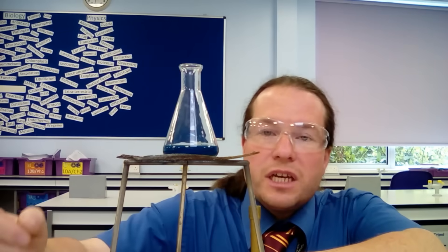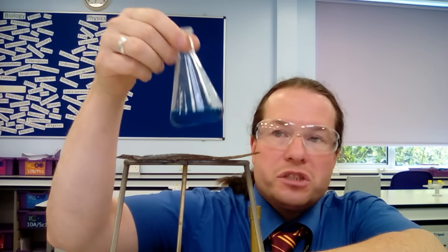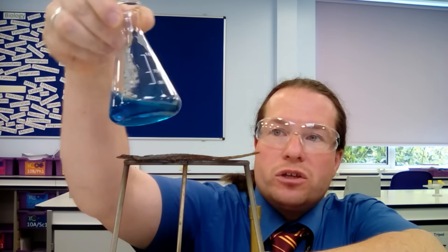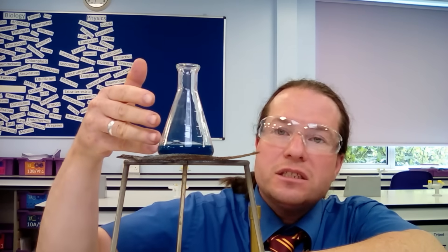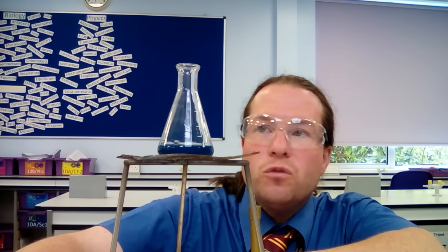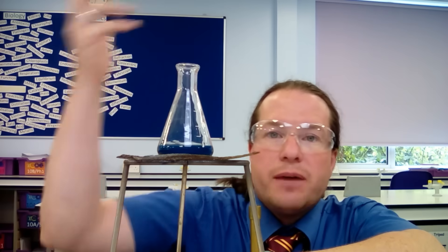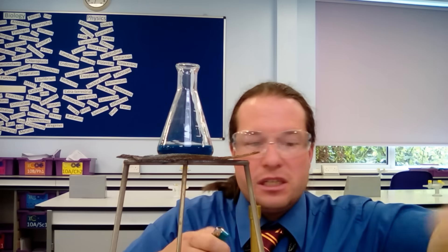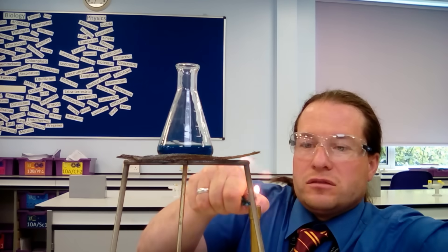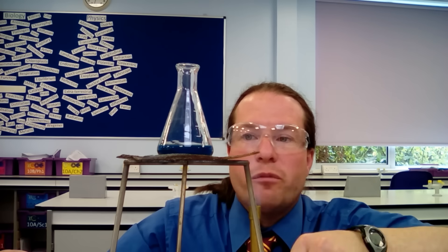Here we can see a different set-up: instead of having that bain-marie type system, I've just got a conical flask with my copper sulfate solution in it. I can heat this and it will evaporate off most of the water, but because it's a conical flask I'm not going to get much spitting. So let's set this off heating and we'll have a look at the crystals we managed to get.